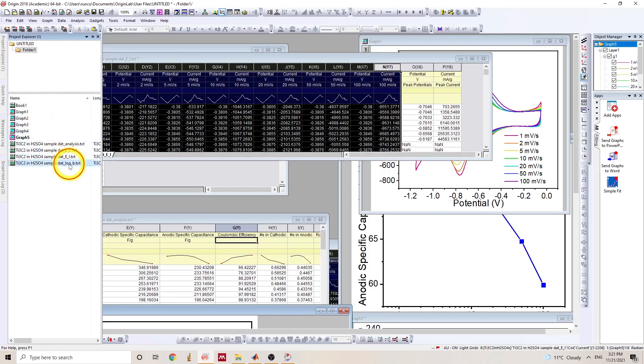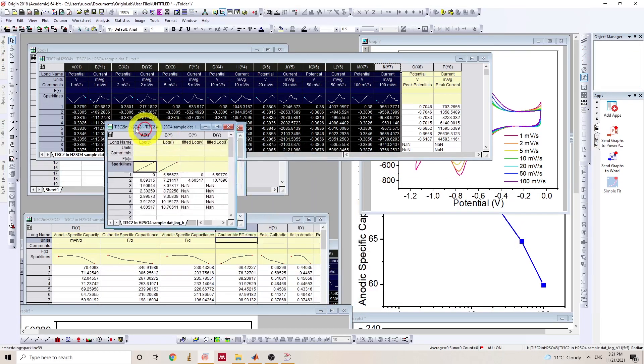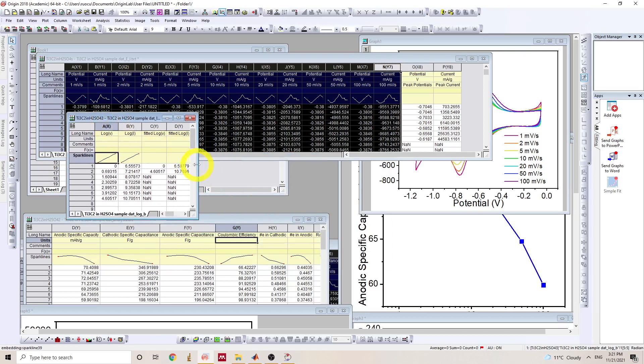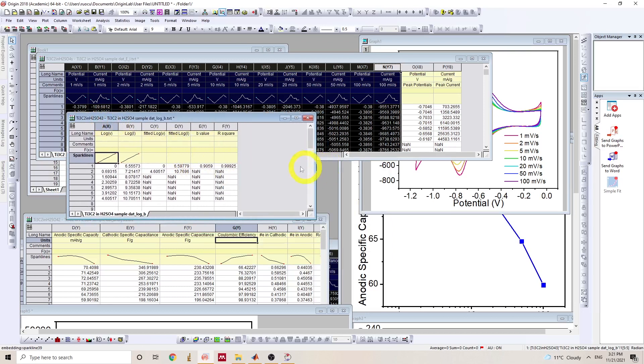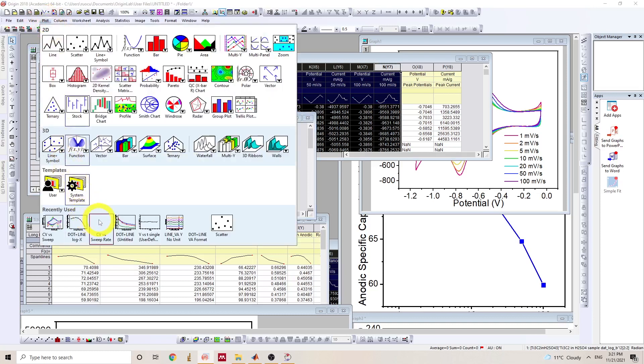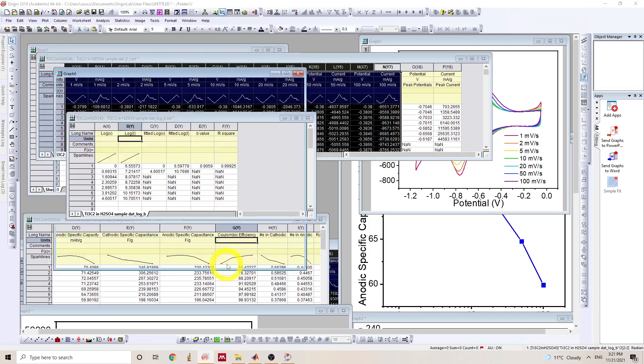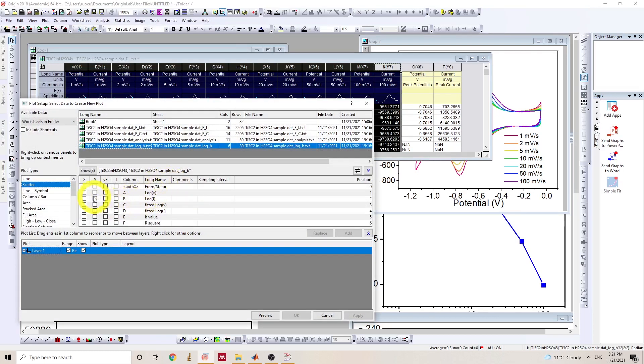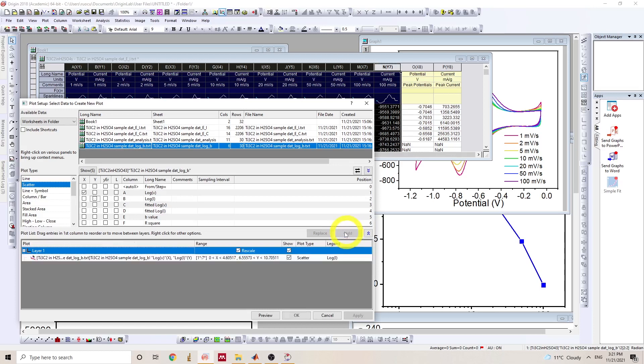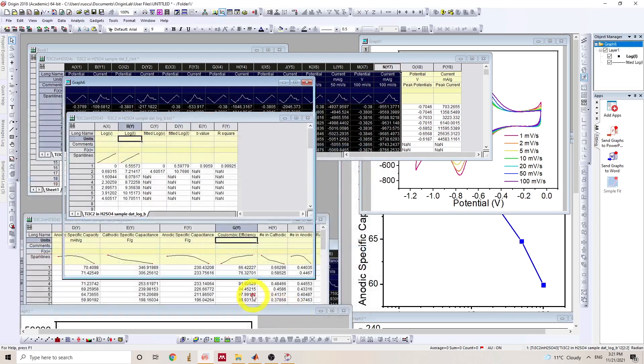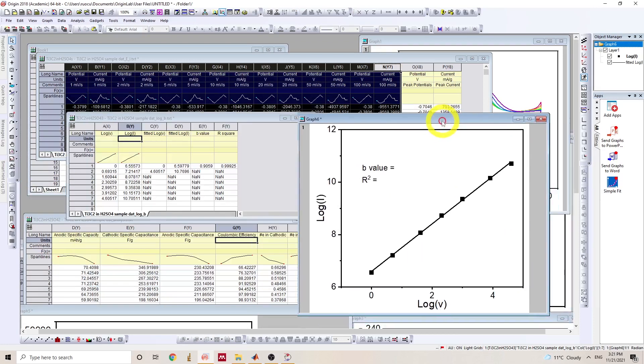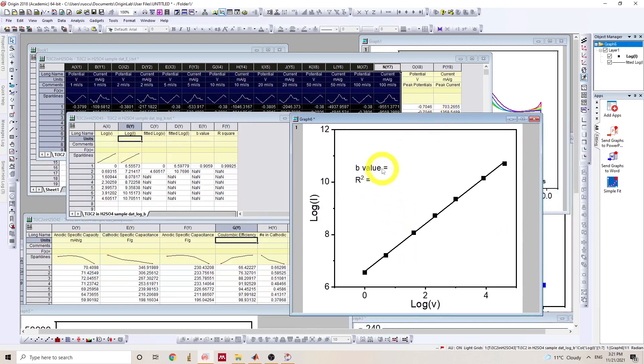And with the last data file log B, this contains the fitting and the b-value and R squared. So with this data file, I will plot log V versus log I, sorry, log nu, that's the log of sweep rate, as scatter. And I will plot the fitted line as a line. So here we go. And we can put the b-value here.